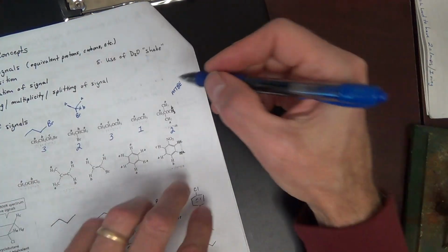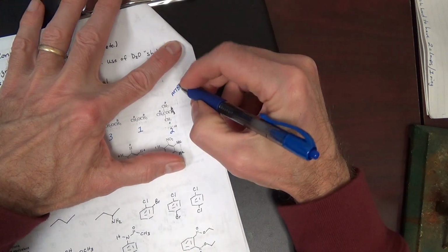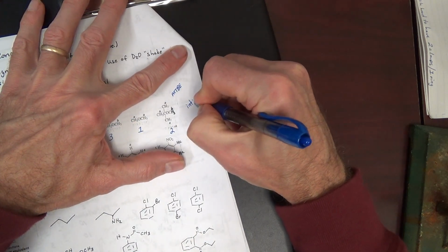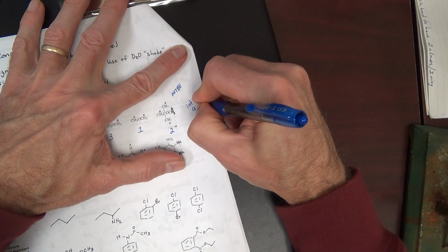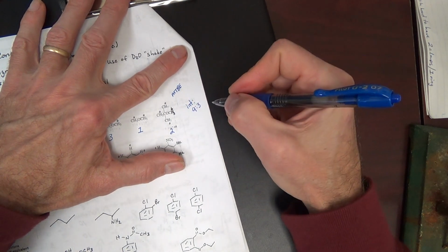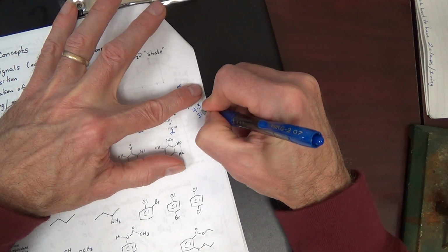The third topic will be integration. We can go ahead and sort of foreshadow that a little bit. The integration is going to be 9-3 for the 2 signals, or we can take that down to 3-1.